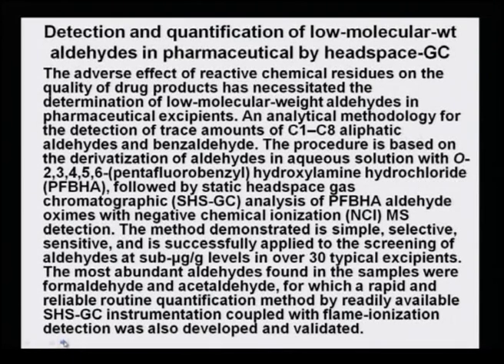Detection and quantification of low molecular weight aldehydes in pharmaceuticals by headspace GC. Now, when we come down to certain examples, we have to understand how these compounds, very typical organic compounds, are analyzed in a GC machine or a GCMS machine.